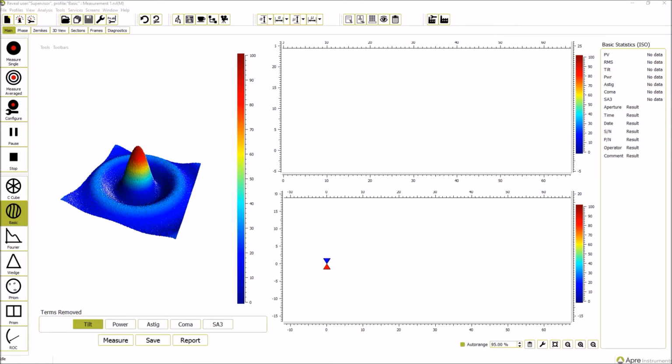In this video we'll discuss auto-sequencing and auto-saving of files. These features allow you to start a measurement, run overnight, and then look at the results the next day. So first off, to find the auto-sequencing, we see these icons here.